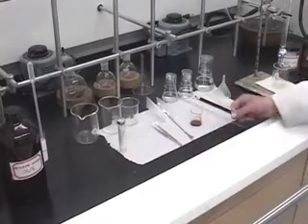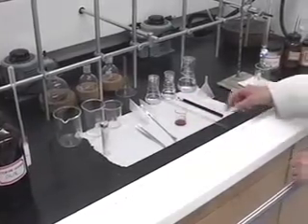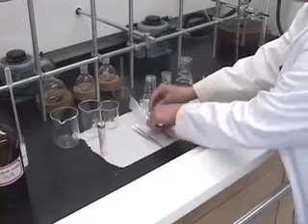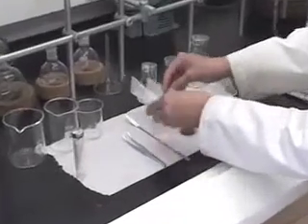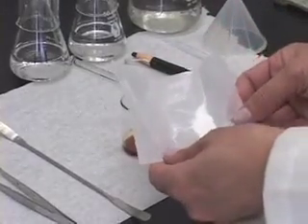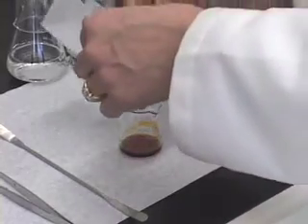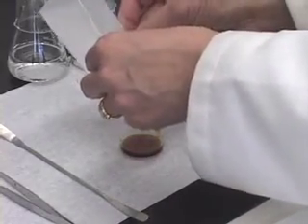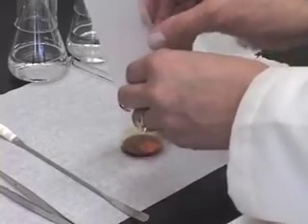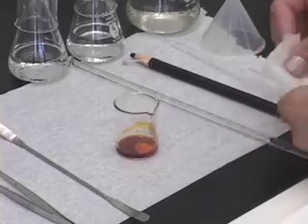Let us continue with the preparation of the sample. After spotting the TLC plate with this mixture, add about 0.5 gram of basic alumina. I have weighed 0.5 gram of alumina on a top loading balance. After finishing weighing the alumina, add this alumina to the dissolved mixture of ferrocene and acetylferrocene in this beaker.